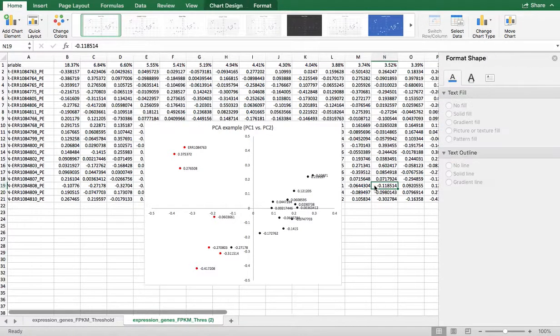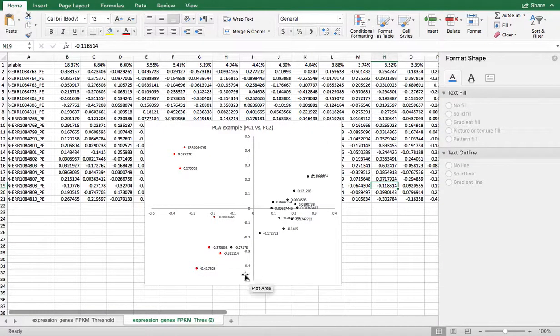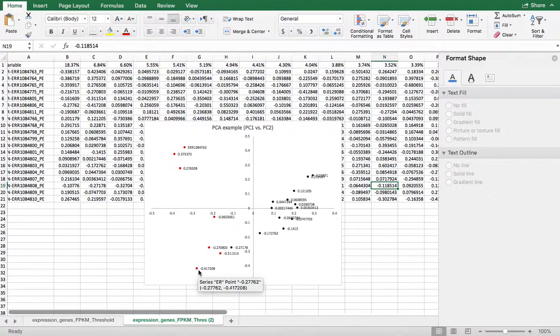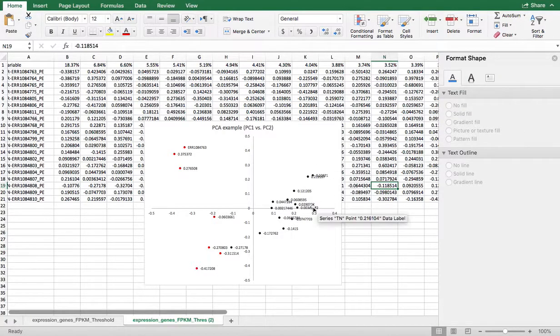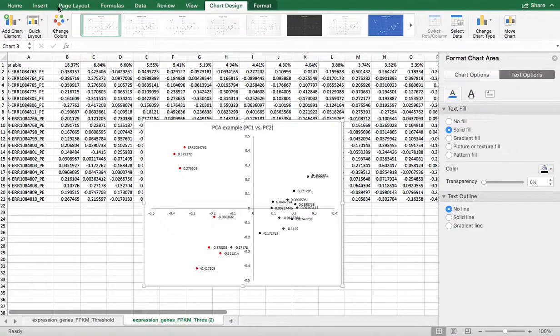That's how you work it. You can do a lot with this chart now. But at least what you can see is that the samples are separated. Here's my ER group and here's my triple negative group.